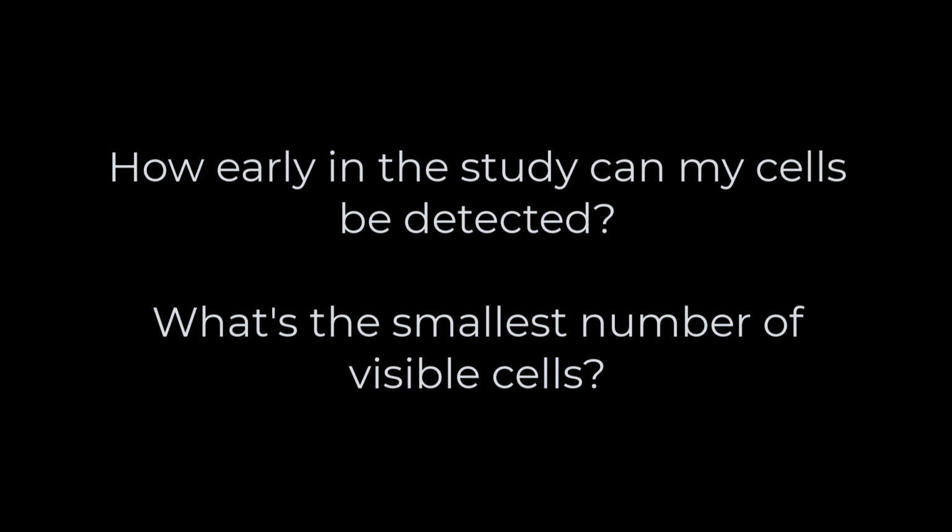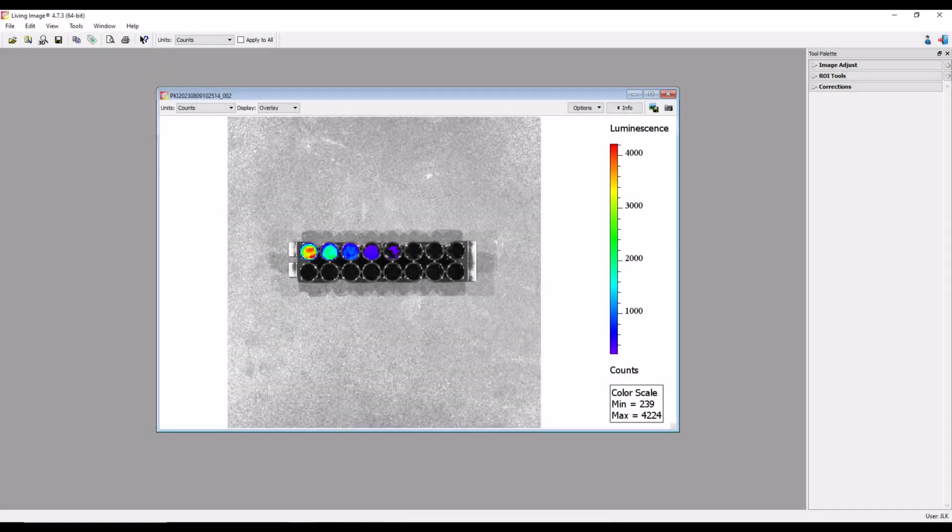Furthermore, accurate quantitation over long periods of time or between studies using different cell stock or passages should be tested to ensure the light output remains consistent. The number of passages and especially the number of freeze-thaw cycles can affect the average photons per second per cell. For this reason, it's recommended to routinely perform in vitro characterization of your cells. Our in vitro analyses have provided us important insights into strategies for cell labeling and evaluation of transfection efficiency.